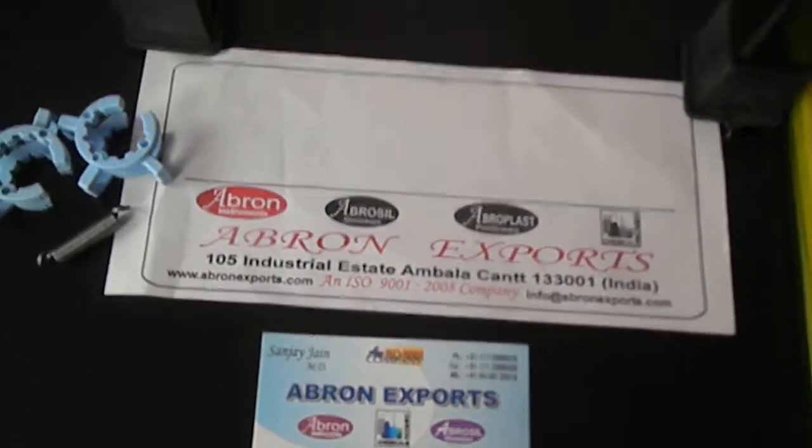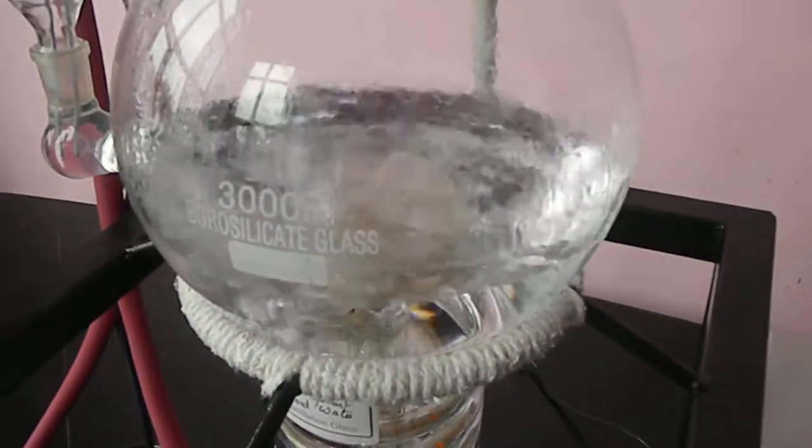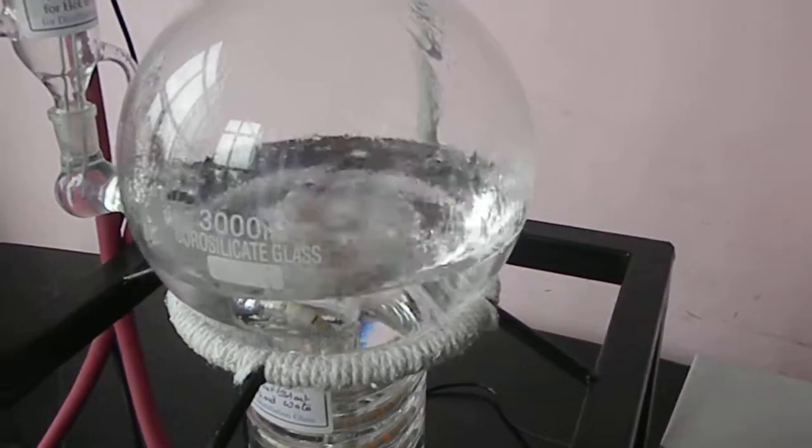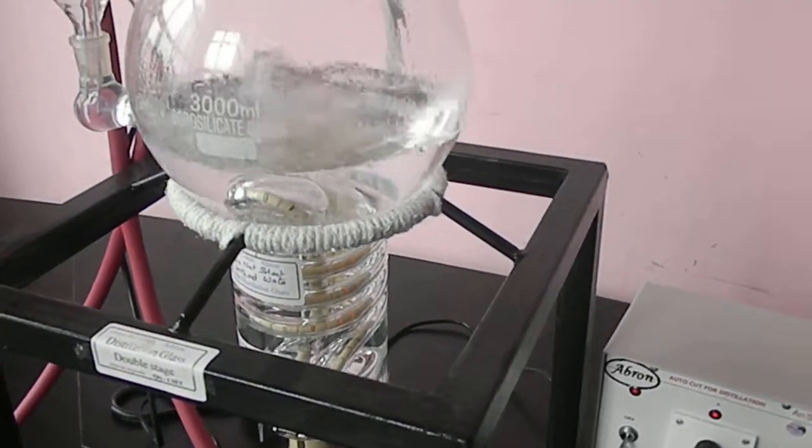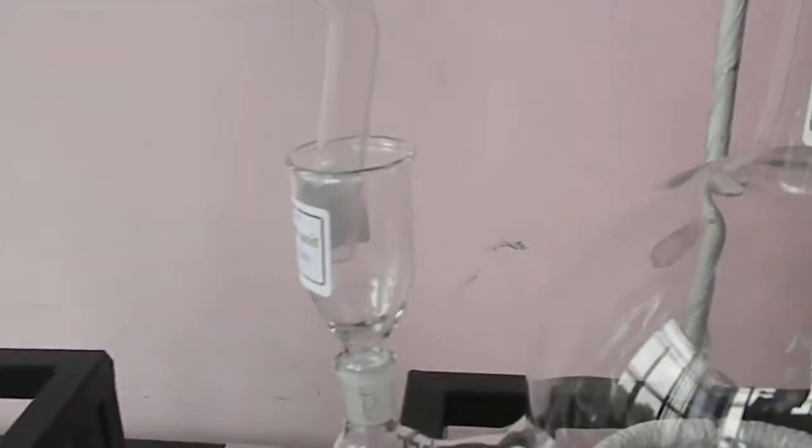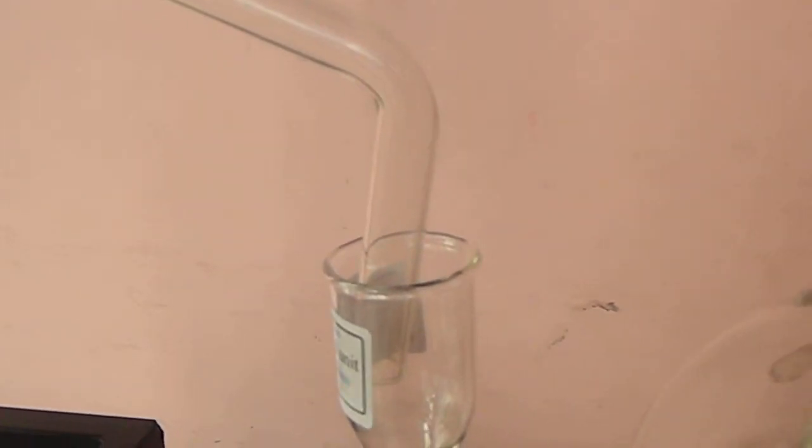And use it. Now see this has started bubbling. And now the cold water will be coming up and working. This distilled water will have drops in this. After this, collection of the drops will be there.